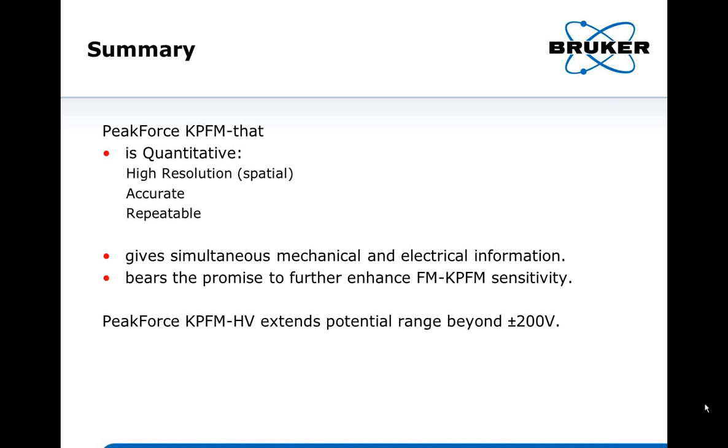Another question here about that artifact. Can you explain the artifact? In that artifact example, we slowly raised the distance in the KPFM measurement, and we saw a very sudden disappearance of the KPFM signal. I see that the person asking indicates a follow-up by email is okay. I think it'll be a longer explanation. Yeah, I can touch on that briefly.